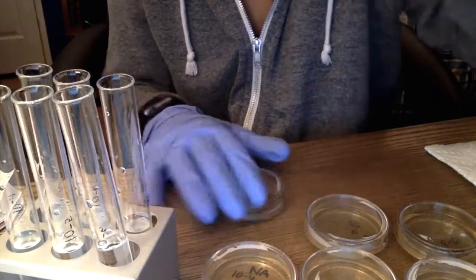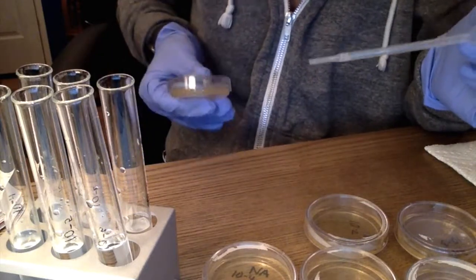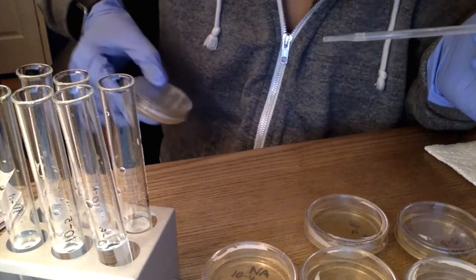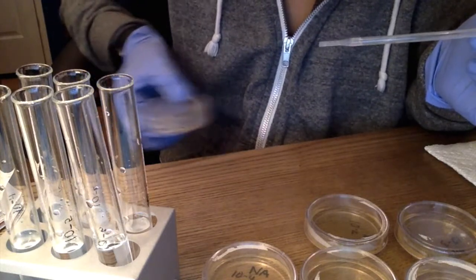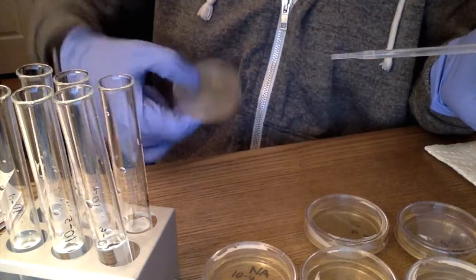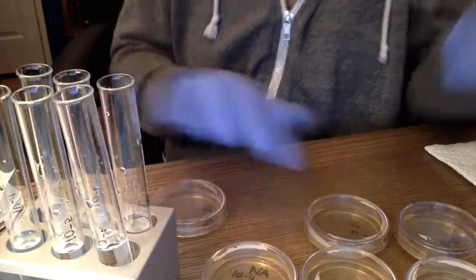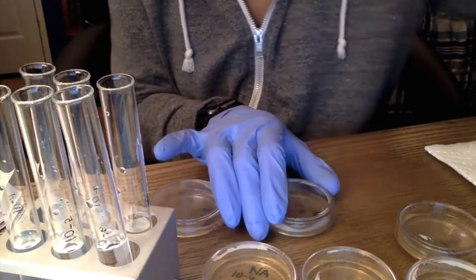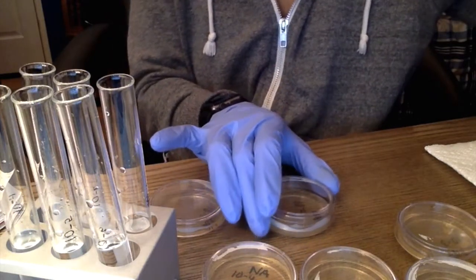And now I'm just going to swirl the plate a little bit so I make sure it gets all over the surface, the agar here. There we go. And I'm going to proceed to do this now that I got all of that solution out. I'm actually going to rinse it out just a bit.